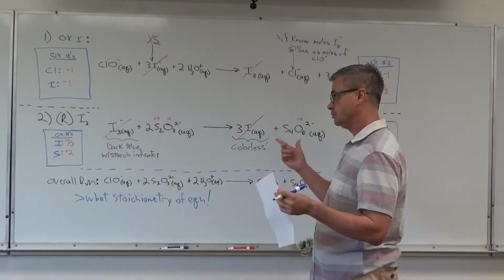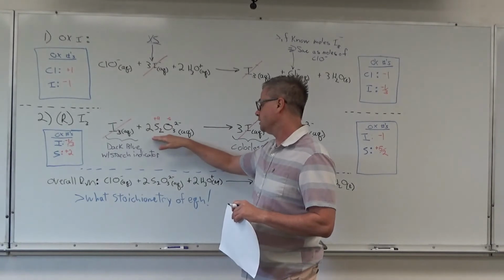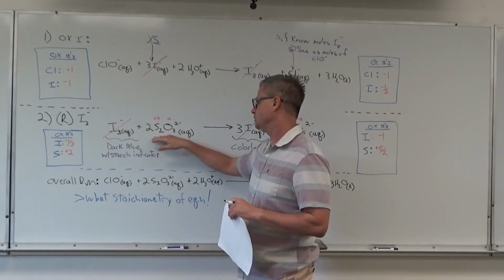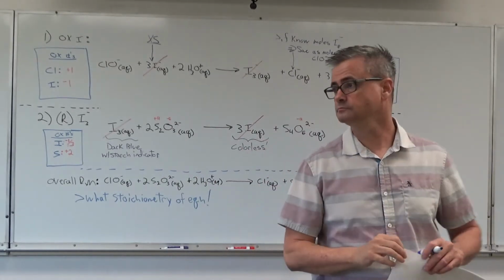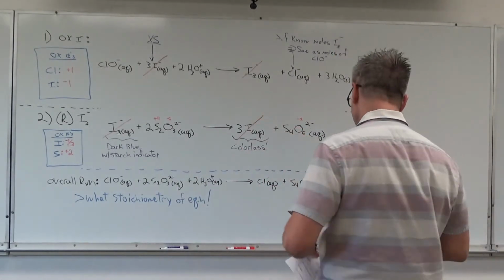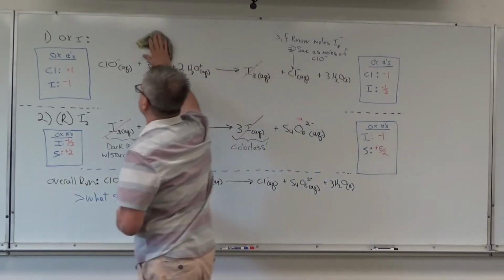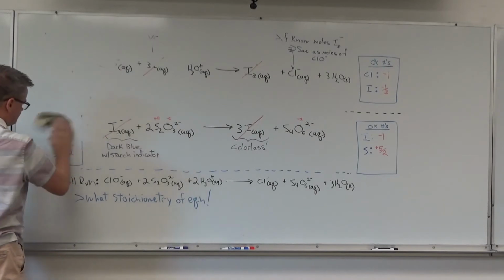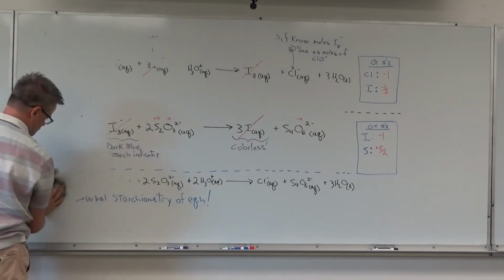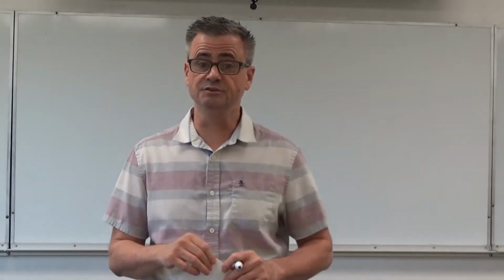Then also you want to pay close attention to how many molecules of sodium thiosulfate you need for each molecule of triiodide. A few more details, but that's about it. It's fairly straightforward actually, but there are a few more details that I want to help you appreciate. So some extra details.